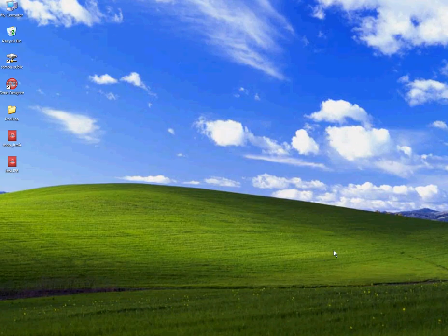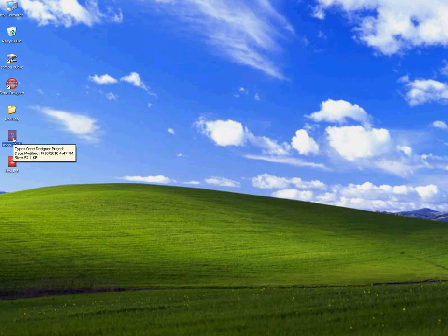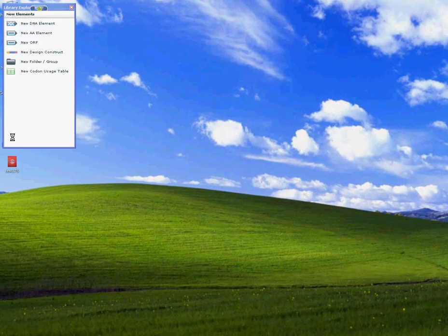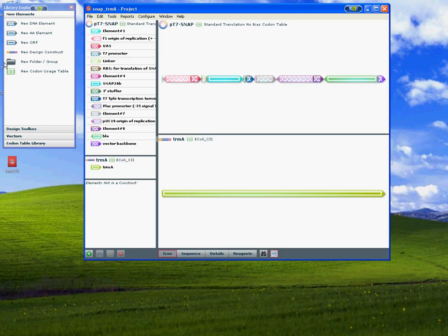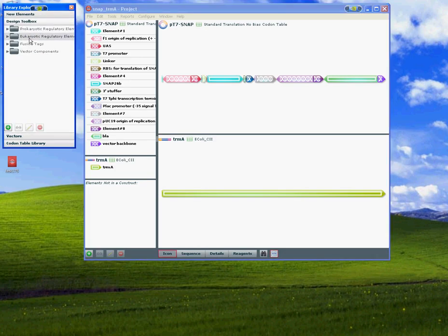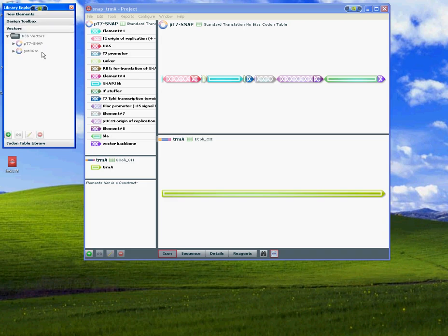Let's start by opening up a listing file. On your left-hand side you'll find the Library Explorer. Here you can create new elements. There's also a box of existing elements, a box of vectors, and a box of codon tables.